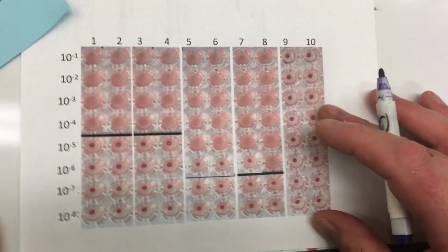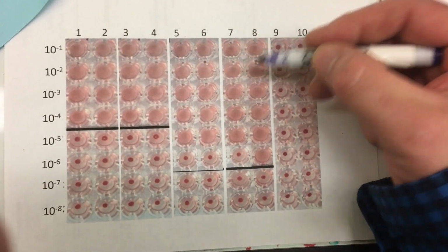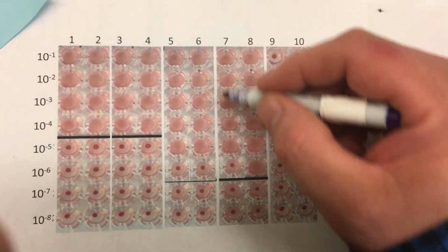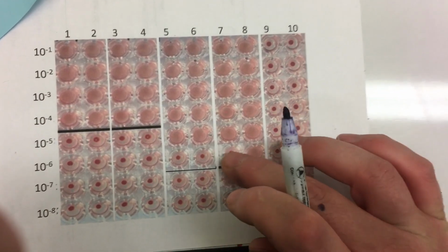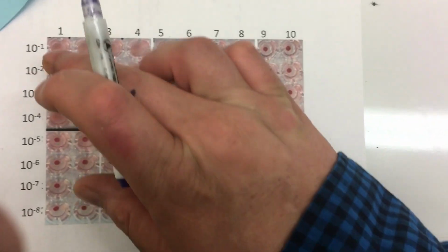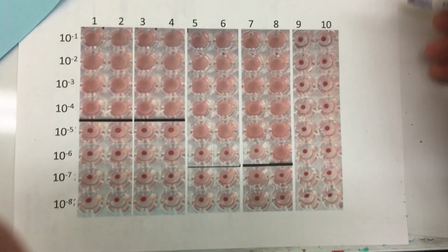If we go to the second sample, we can see that there's a slightly different titer here. So we have to do the same thing. We have to calculate how many of the wells are infected per dilution. Running all the way down, this one is slightly different in that when we get to the 10 to the 6th, not all of these wells are infected. 3 of them are not, 1 of them is. So we're going to have to calculate the percent all the way down to 10 to the 7th, because that's where we have a 0, so there are no wells here that are infected.